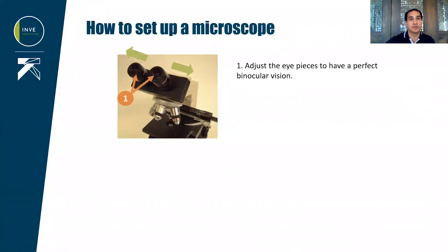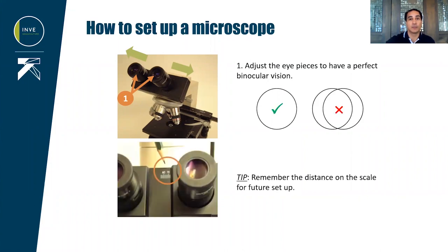We now need to set up the eyepiece. Adjust them until you have a clear binocular vision, which means that when watching, you should see only one circle and not two circles close to each other. If you are using a microscope frequently, you can use the scales to note the distance between your eyes for future setup. The scale between eyes may vary on different models of microscope.